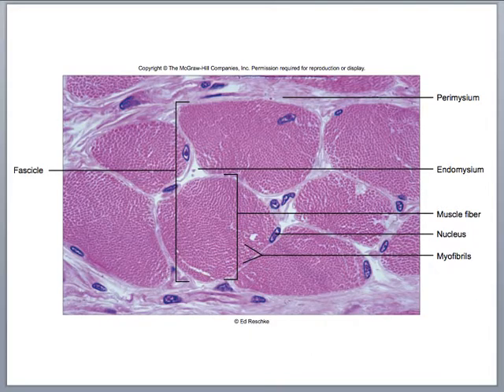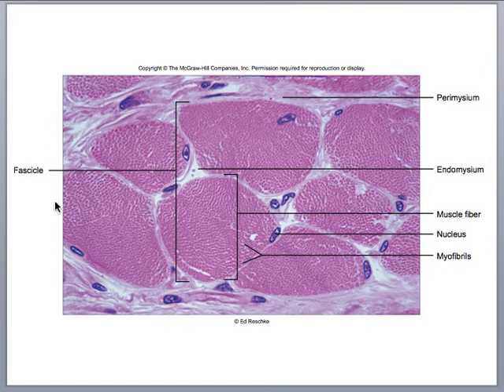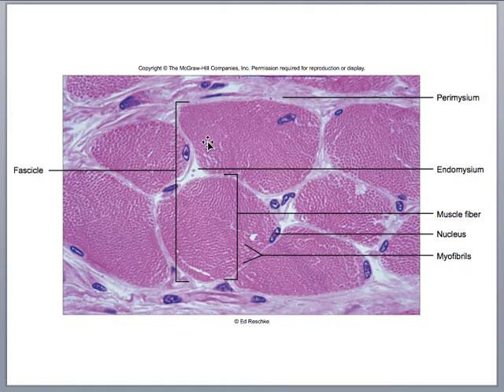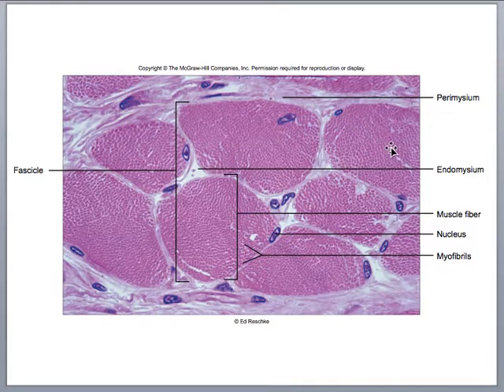This histology slide shows a fascicle — a bundle of skeletal muscle cells — and the connective tissue perimysium that surrounds the fascicle. Each one of these is an individual skeletal muscle cell. The nuclei are pushed to the periphery, and surrounding an individual skeletal muscle cell is the endomysium.